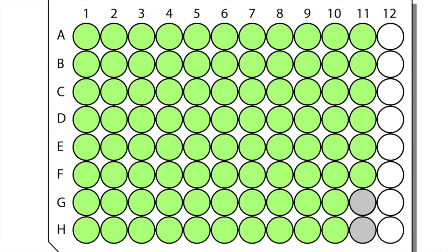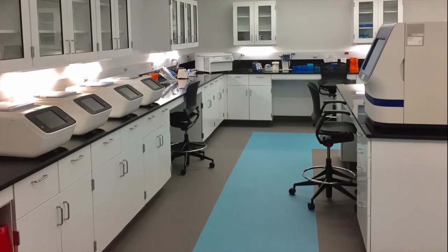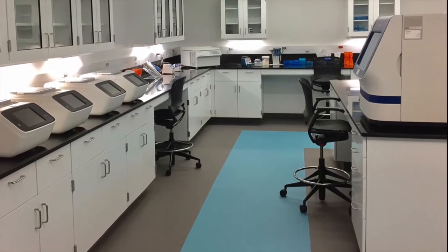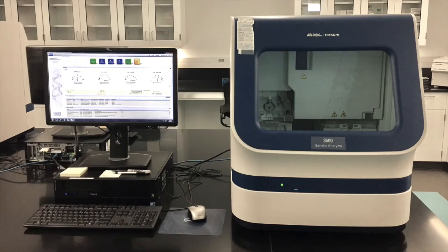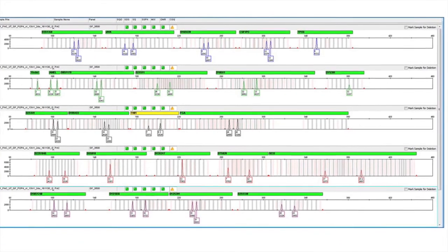A DNA sample is then removed from the tube and placed into a small plate with multiple wells. Next, the extracted DNA is taken to a clean room, where copies of the DNA cells are made in order to have a large enough sample to read. Another machine reads the DNA, and a software program will convert what it sees into a digital graph of colorful peaks and numbers, which can be used to identify a person.